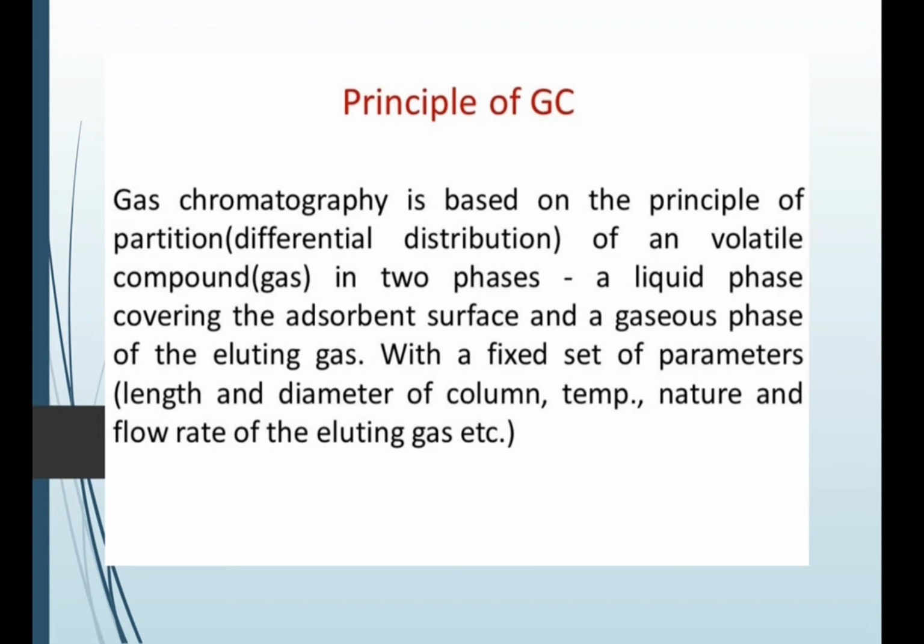And here is the principle of gas chromatography. As we know, gas chromatography is a separation technique. So this is the principle: gas chromatography is based on the principle of partition of a volatile compound in two phases, a liquid phase covering the adsorbent surface and a gaseous phase of the eluting gas. So here are the two phases. The stationary phase is the liquid and the mobile phase is the gas.